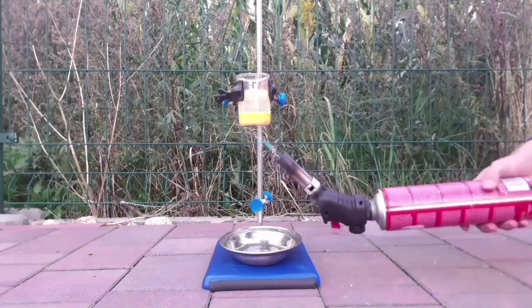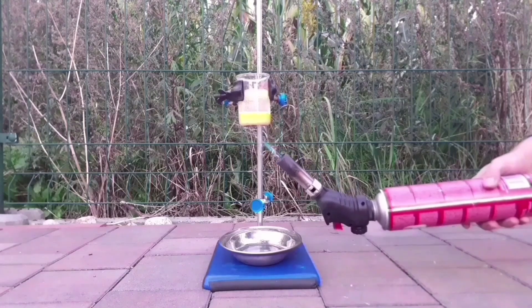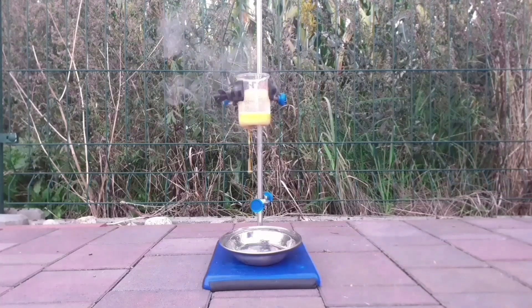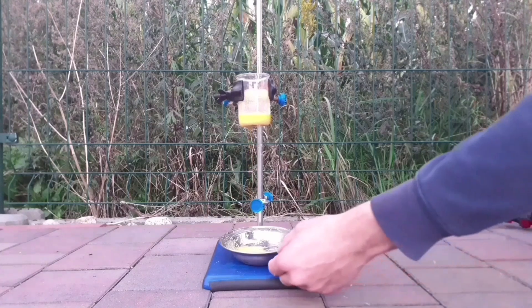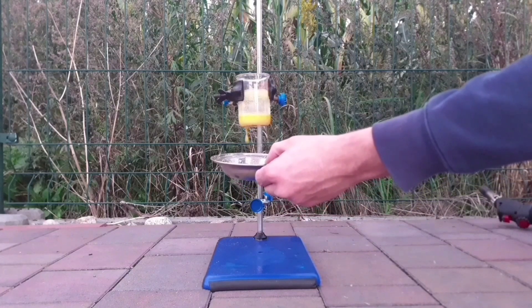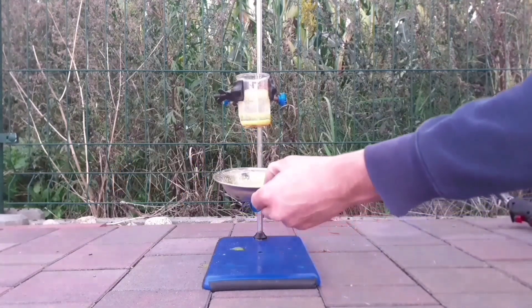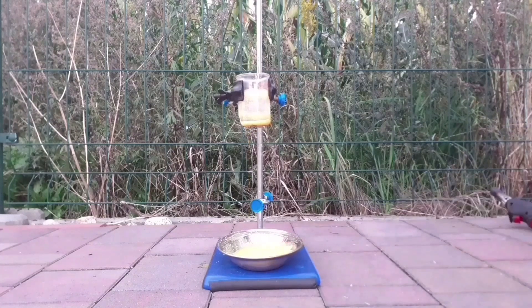Being the fool I am, I believed that the beaker was made out of Pyrex glass. Brain injury.